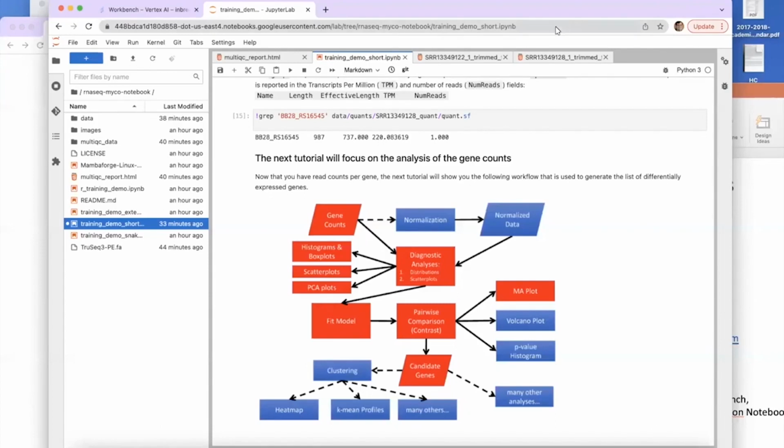After running all of the steps in this workflow, it is important to then shut down the virtual machine so that it's no longer running. Because as it's running, you are accumulating charges. There's not a lot of money, but if you left your virtual machine on for several days, obviously it could cost quite a bit. And so it is important to do that.